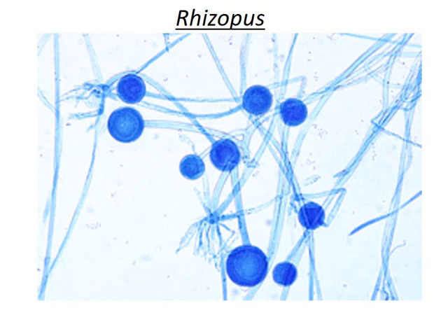This is the structure of Rhizopus observed under the microscope. The microscopic observation again reveals the filaments that are the sporangiophores, and these sporangiophores bear the sporangium within which the spores are present. What we can also observe are the foot cells that contain rhizoid structures — root-like structures — and that is how Rhizopus can be distinguished from Mucor species.